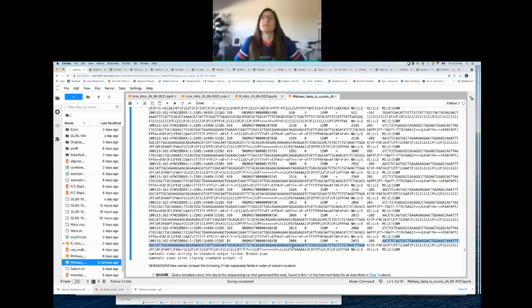And I just want to point out, because I know yesterday when I was showing you guys multi-mapping, I used the example of 150 read length, or 150 base pairs, and Felix pointed out that it was pretty surprising that a repeat of that length could be seen in multiple locations in the genome. And as we're seeing in our actual data, this is even longer, right? This is 203 base pairs that are mapping to 5 different locations on the genome. So our genomes are highly repetitive. And that's, again, why longer reads are always going to be better.